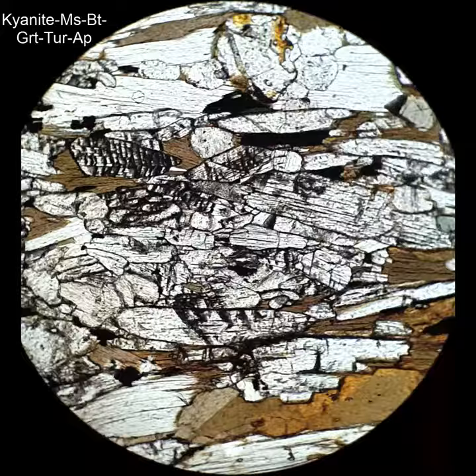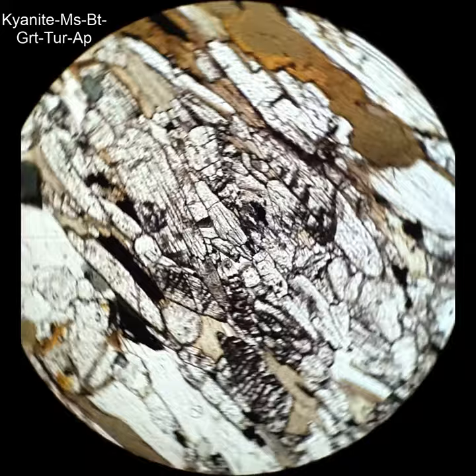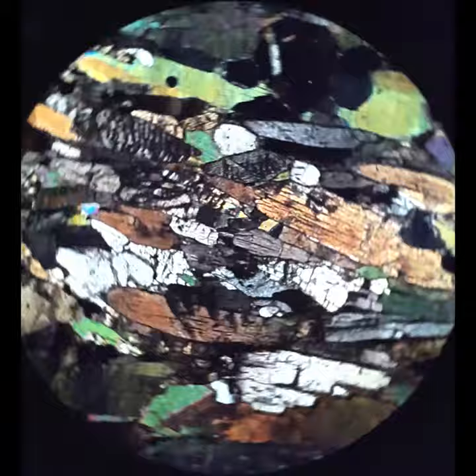This is a whole cluster of kyanite crystals. There are some that are elongate and they have the thin cleavages parallel to the elongation, and then there are others that are a little chunkier and they look all broken up. That's because it's really hard to polish that orientation of kyanite, and so it actually does get kind of broken up where that parting is so strong. Again, you can see really low interference colors.